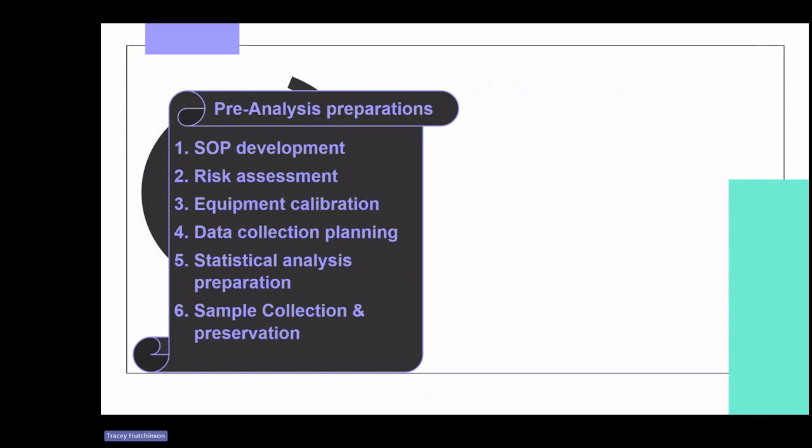in conducting a comprehensive risk assessment related to sample collection and initial handling. You identify potential hazards and risks associated with the collection process, emphasising the importance of mitigating risk through proper safety measures. Ensure that students calibrate and verify the calibration of lab equipment used in the analysis, such as microscopes and staining apparatus. Emphasise the significance of accurate measurements for reliable microscopic observations.